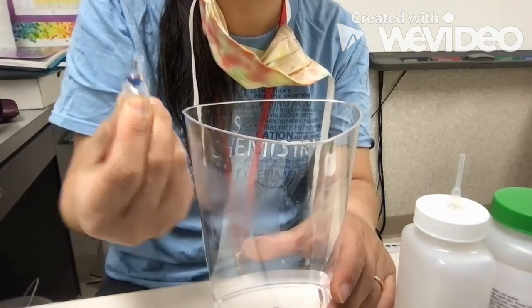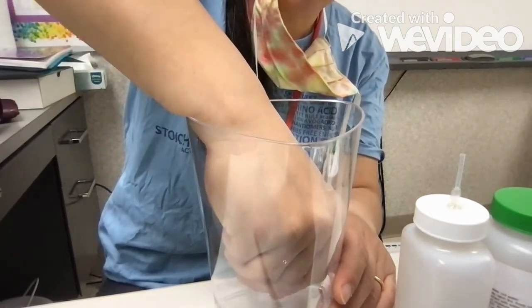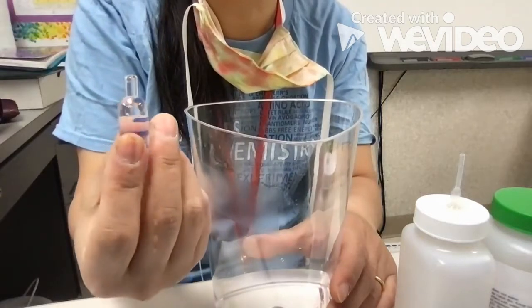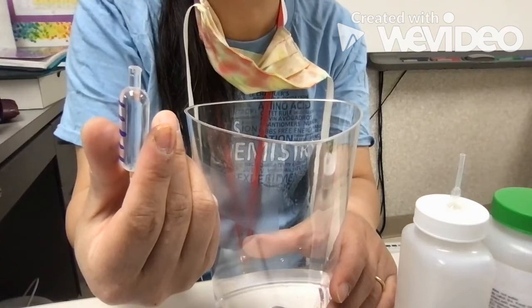Squeeze it as hard as you can, then put it back into the water and let it go and fill up. And now you have a perfectly filled micromole rocket. Okay, so that's how to fill the micromole rocket.